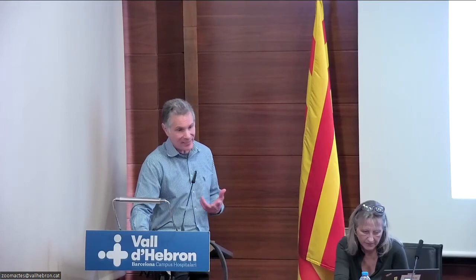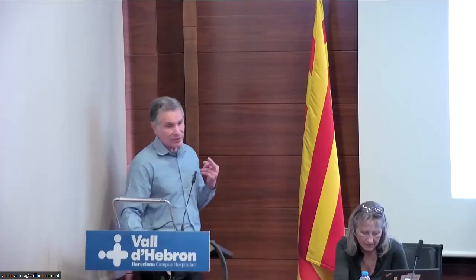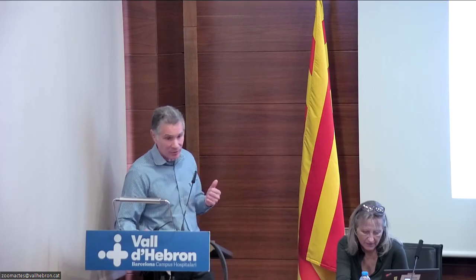So when it comes to looking at metastases, as Guillaume showed you, you can detect very small clusters of cancer cells. But as I also showed in that model with the marmoset, you've now got the ability to see single cells at depth in tissue. The paper that Guillaume showed was using T cells. There was a paper we published in 2010 showing you can see a single cancer cell subcutaneously. Since then, the group from Japan showed that you can see single cells at depth in larger animals as well.